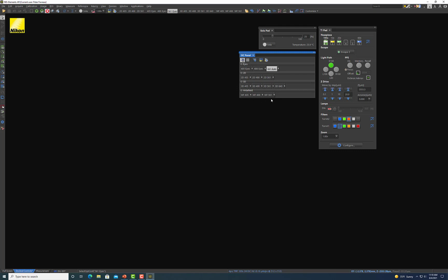And these are just images acquired like you saw just a couple minutes ago in the slide, where it basically mimics a wide field approach. So this is not SIM, this is just wide field. And I like to use this just to compare how the resolution might appear for 488 versus something like SIM, and just compare the two and see how they look.